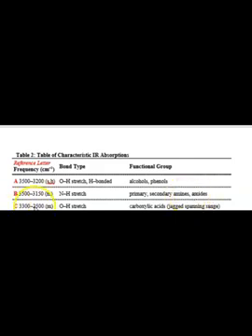Okay, and finally, just another example here of an OH stretch. This would just be the alcohol. Now notice something, by the way. The alcohol is a stretch between these two numbers, okay? But you also have that OH stretch up here in a carboxylic acid. Well, I'm sorry, you have this OH stretch here in a carboxylic acid, but you have this broad stretch here for alcohol, okay? So there must be something different about the OH group when it is on the carboxylic acid. So we're going to look at some of these details later.